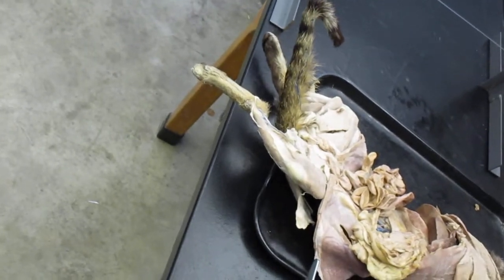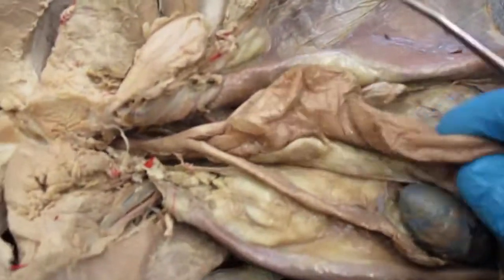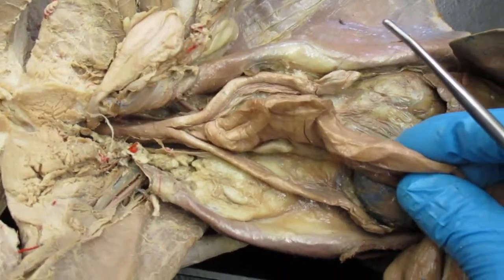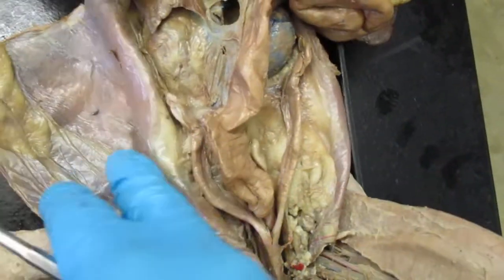Now, let's move on to the ovary and the testis. So, we have the female cat right here. So here's your female cat here. Let me turn around this way. Maybe that's better.